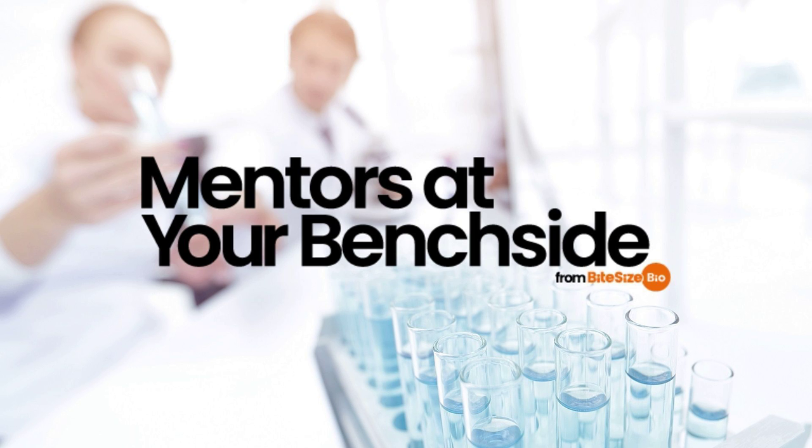And if you work with flasks to grow bacteria on a regular basis, it's helpful to train yourself to estimate OD by eye. This way you can save valuable time by skipping OD600 checks when flasks are clearly not within the OD range you're looking for. It doesn't replace OD600 entirely, but it can help you cut down on the number of times you need to measure the OD600. You might also want to consider using a microplate reader to increase the throughput of your OD measurements.